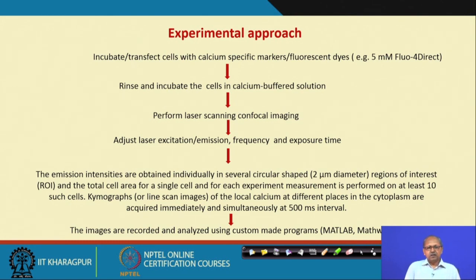In our lab we are working with bone cells, like MG63 cell lines and normal native cell lines from mice calvaria, that is osteoblasts, for calcium signaling using mechanotransduction. In that process we are giving different types of fluid flow to generate calcium signaling. Particularly oscillatory fluid flow is very important because osteoblast-like cells are present in the bone milieu, that is the canaliculi, a capillary network where oscillatory fluid flow predominates.